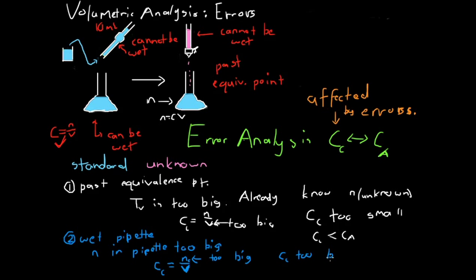That's what error analysis is all about. We look at the error, figure out its immediate effect on the relevant solution, and then follow that effect through the calculations for the rest of the titration to see how it ultimately affects our calculated value for the concentration. It's all about comparing a calculated concentration — affected by errors — with the actual concentration of the solution.